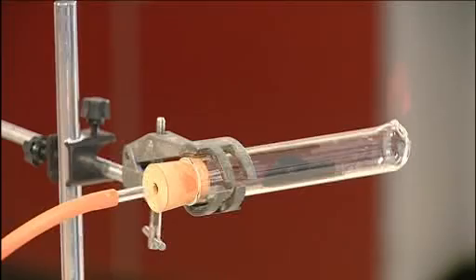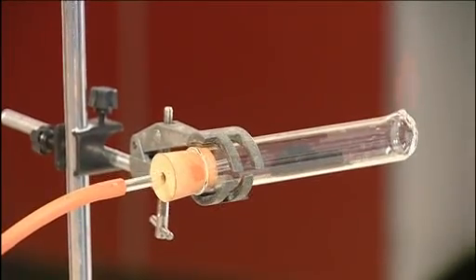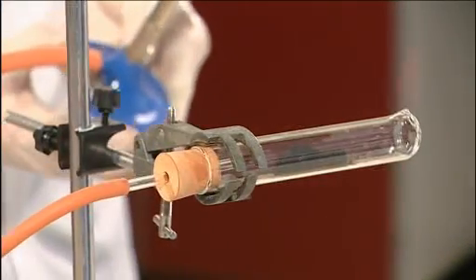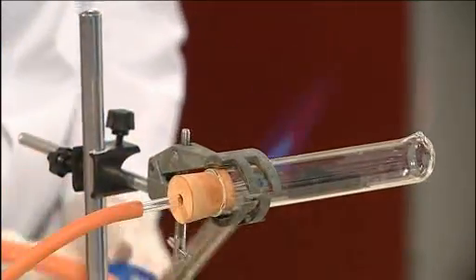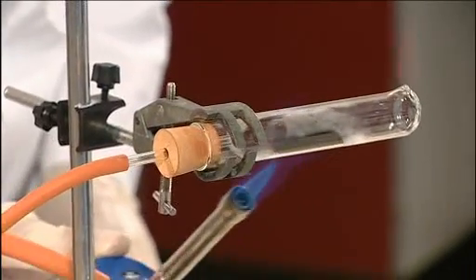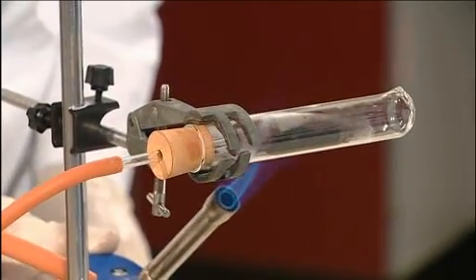Now we heat the copper oxide using a roaring Bunsen flame and using the hottest part of the flame, which is just beyond the blue cone.